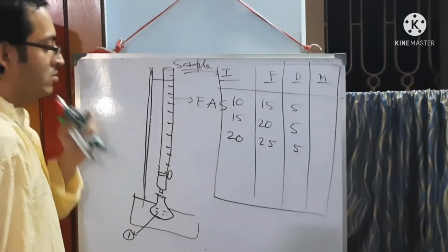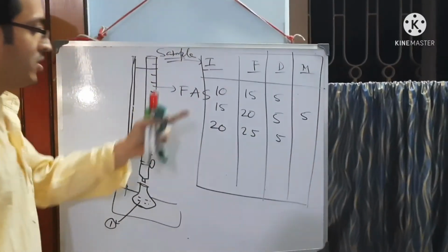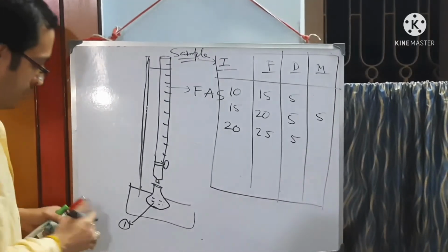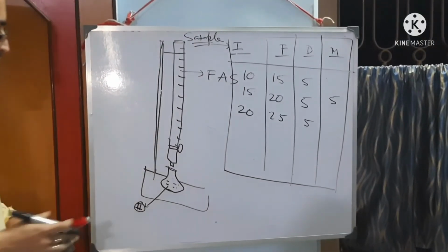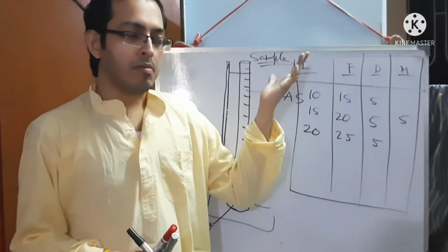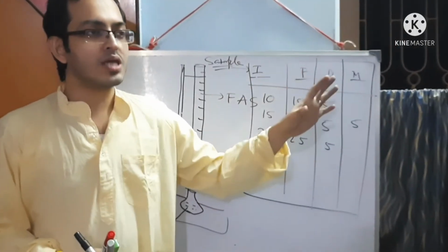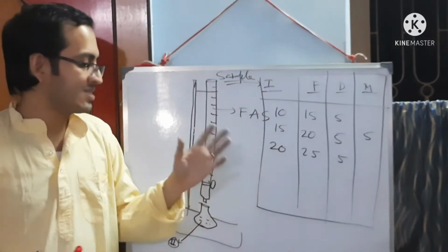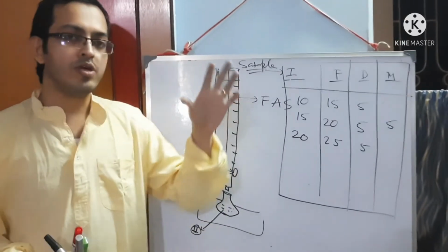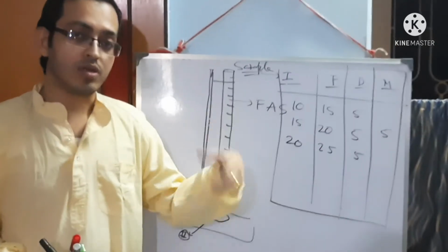Okay, so these are the differences, and obviously the mean reading will be 5. Okay, so likewise we have to do this 3 times titration for the blank also. In the blank, all these mixture chemicals are present except the sample water, where we use 10 ml of just distilled water, nothing else.